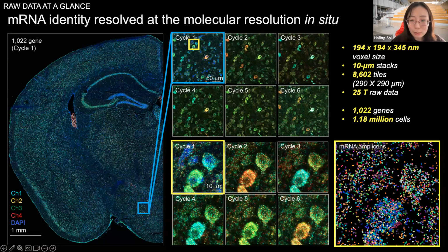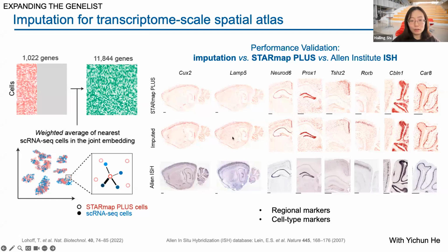Let's see the second part. With the paired single cell RNA-seq data set, it is possible to extend its gene expression complexity. So gene expression abundance and the experimental purpose are two important considerations for choosing the gene list.